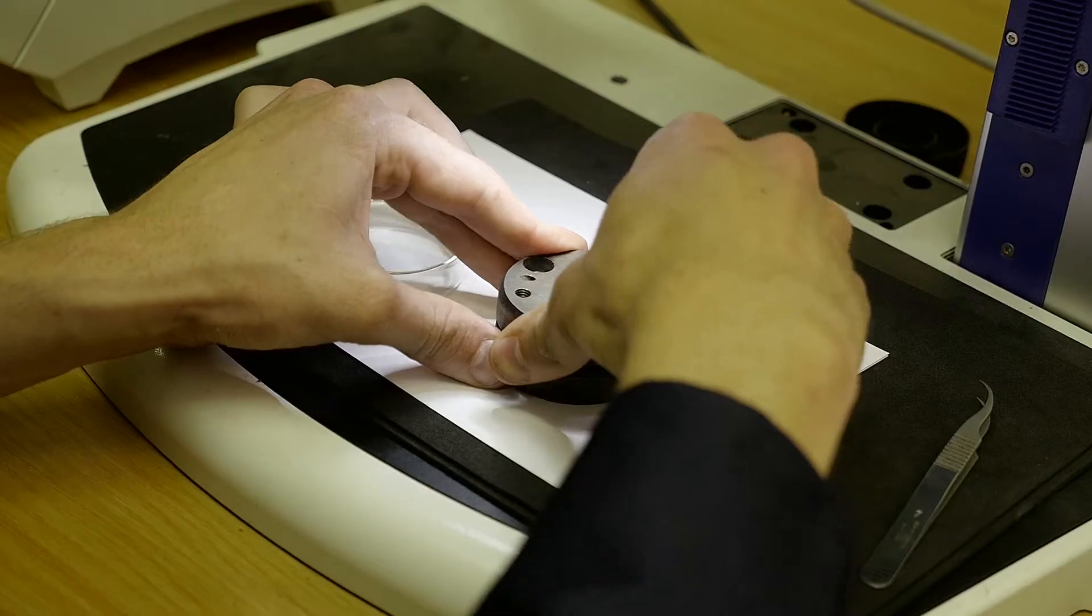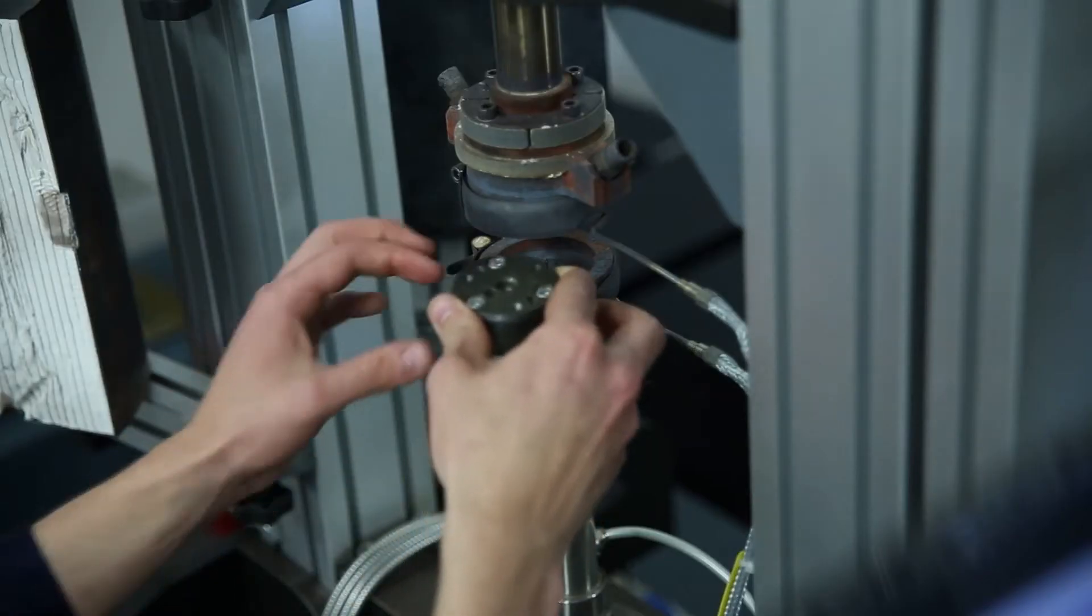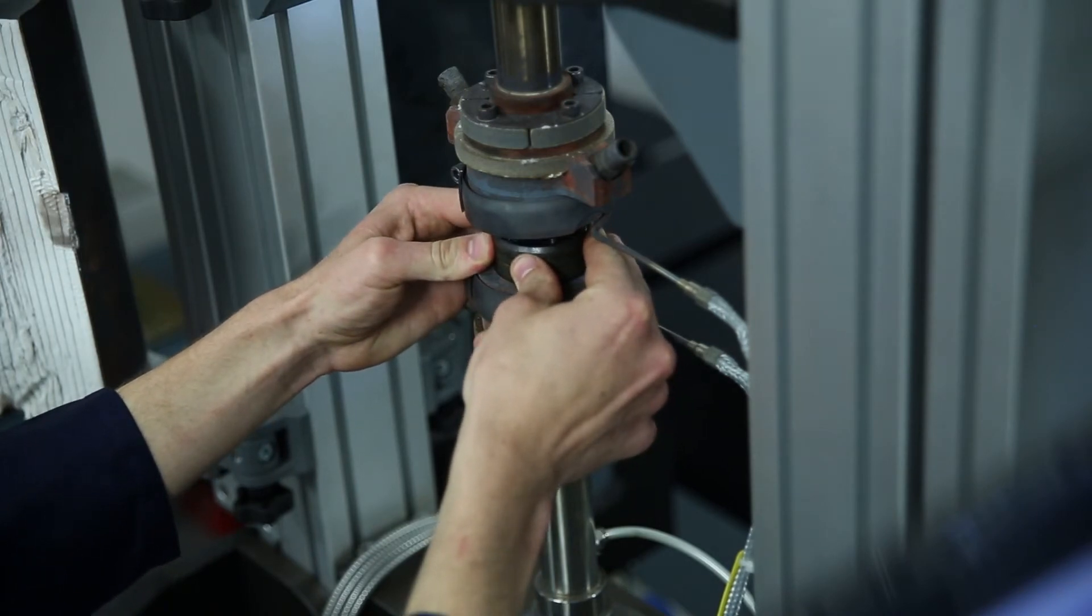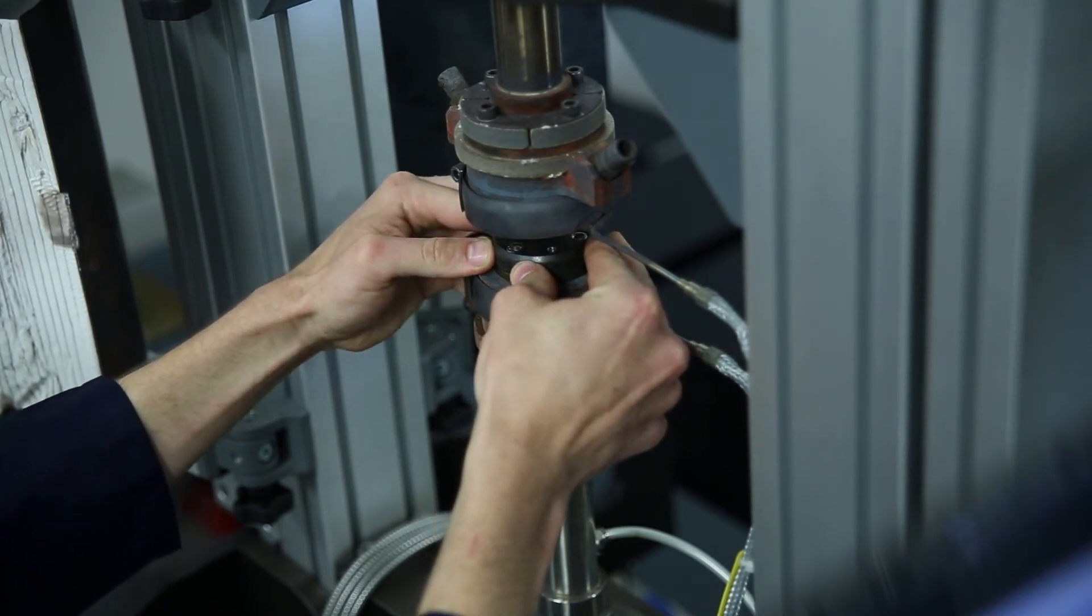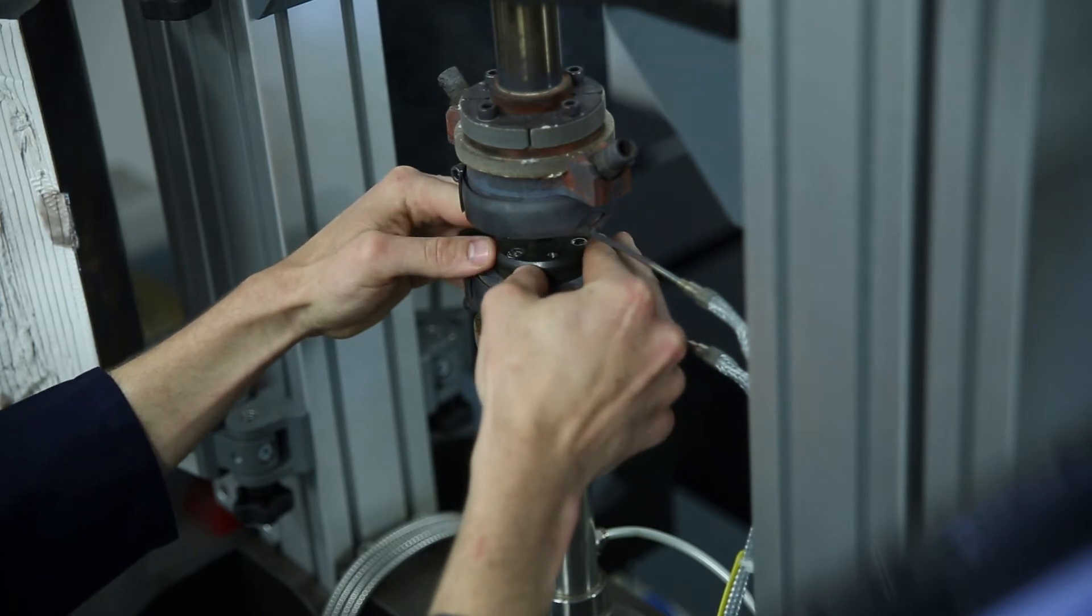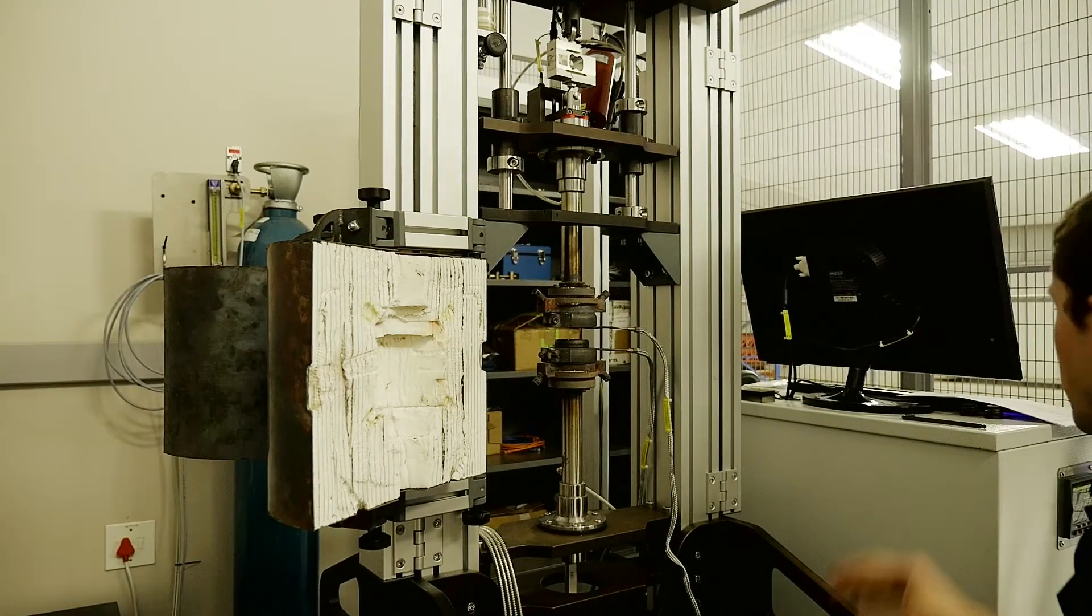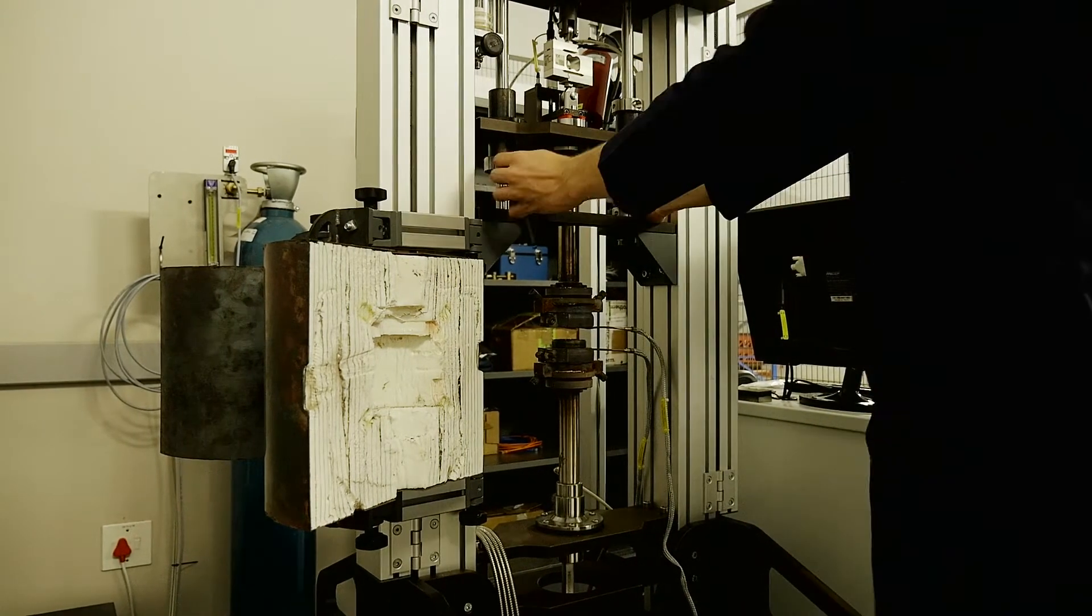The test consists of clamping a sample over an orifice at an elevated temperature and punching it with a hemispherical indenter. As the sample is damaged by creep mechanisms, the punch measures the resultant deflection.